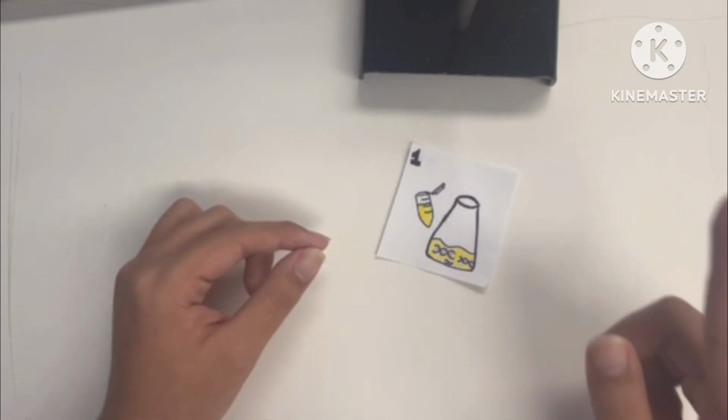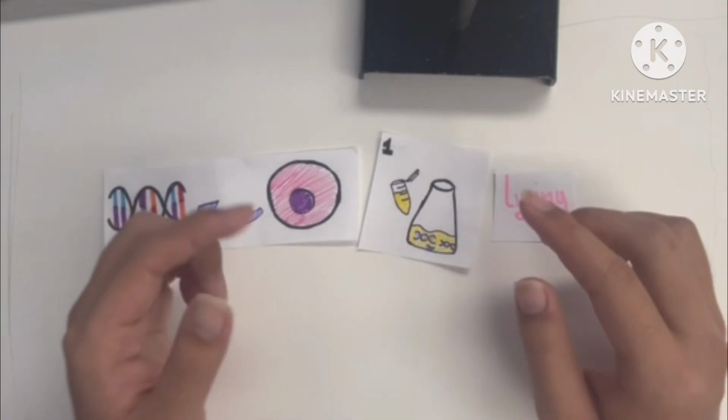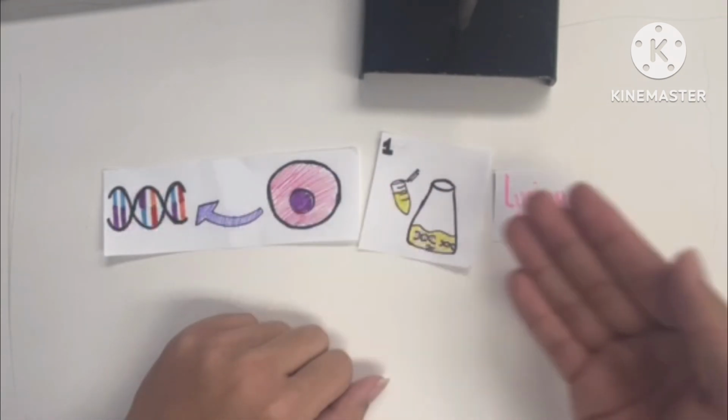To prepare the DNA sample, you must first go through a process called lysing. Lysing is when the cell is broken up using chemical methods, and then the DNA is purified.